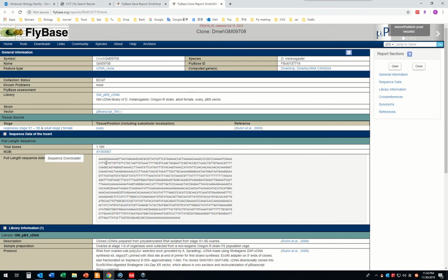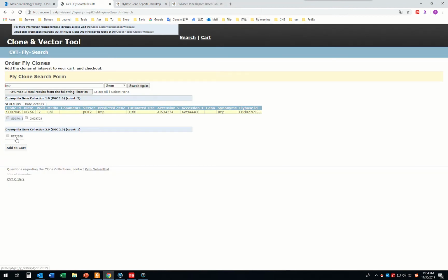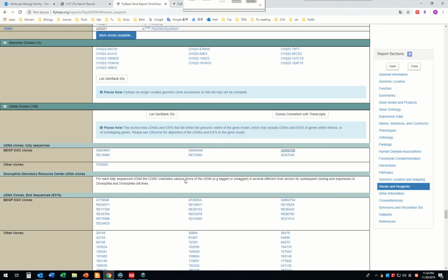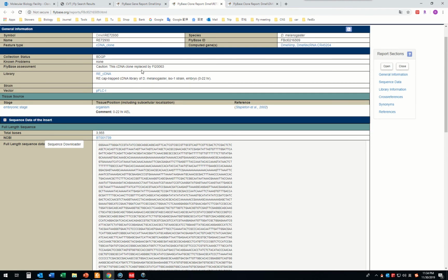Oh, this one is very short. But the last one, this is very long. Replaced.